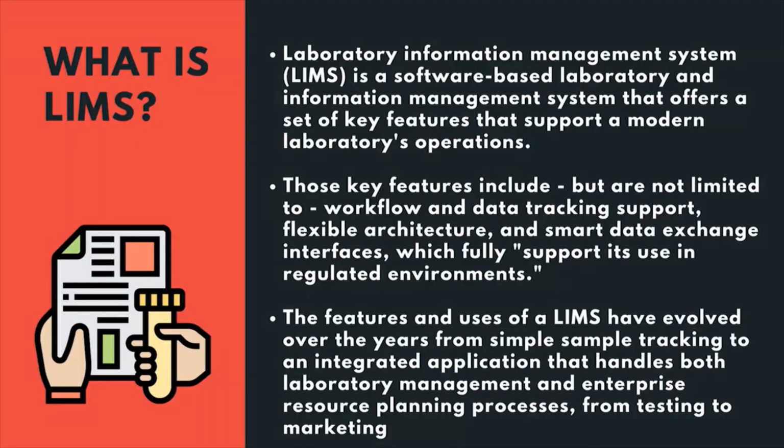Then, to handle all these activities of the quality control lab, we have a software system known as LIMS. LIMS stands for Laboratory Information Management System. It is an exhaustive software that takes care of the sampling, the work assignment to the technicians, defining the on-spec and off-spec criteria, and also the consumables inside the laboratory like the test tubes, the chemicals, acid, etc. With the help of the LIMS software, today the functionality of the laboratory is greatly enhanced.